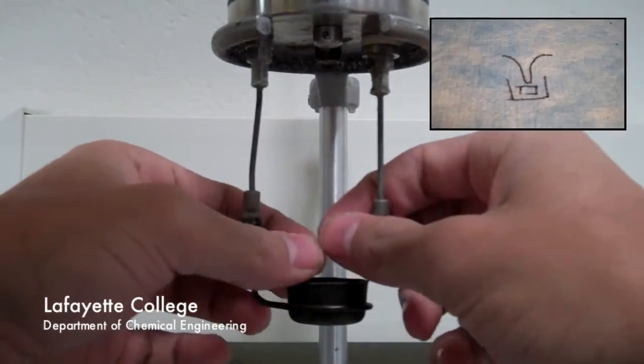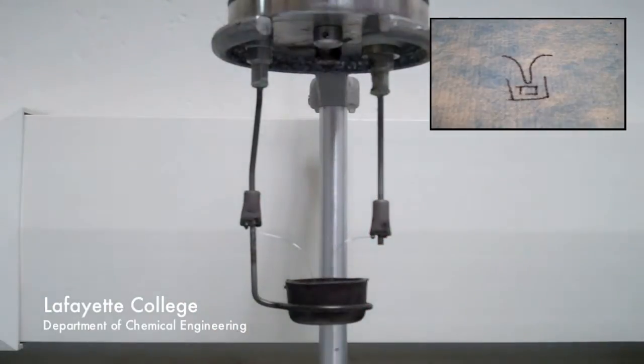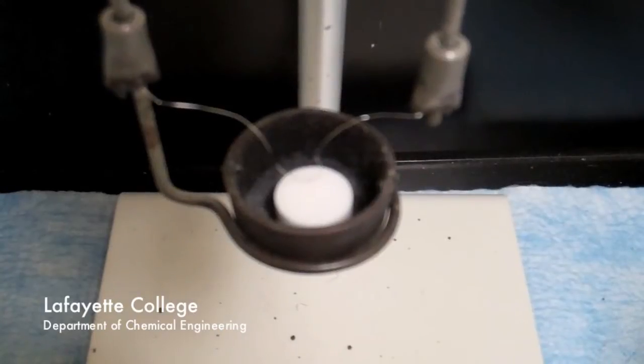Bend the middle of the wire in a U shape so that it passes just barely over the sample. The shape of the wire and distance from the sample are very important and must be done correctly for the sample to combust. See the inlay for a schematic representation. At the end it should look like this.